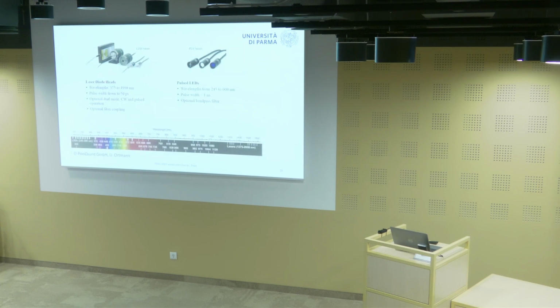Here is an example. You have a variety of small-size solid-state lasers available today, emitting in the picoseconds. I have several in the lab emitting 50 picosecond pulses, very short. In some cases, you might want to go for LEDs. They are broader, but they have the advantage of being cheaper, so you can buy more for the same budget.